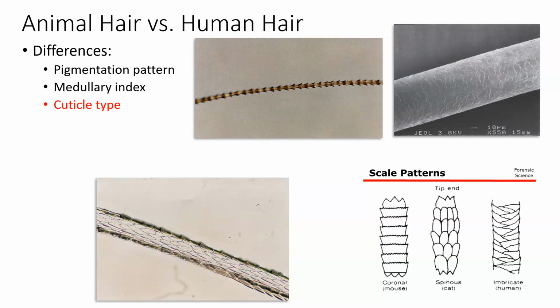Now, when you look at this, hopefully you would know right away that this is not a human hair. This is not the way human hairs look, and this is not a human hair as well. This one is. Okay? When you look at a human hair under a microscope, you will hopefully see that we have just kind of these really small, finite scales that overlap from scalp to tip, kind of like mini shingles, which helps to secure the hair and the medulla and the cortex within.